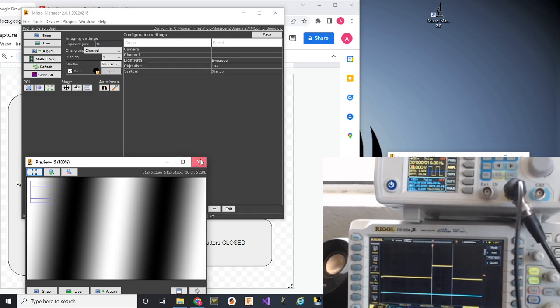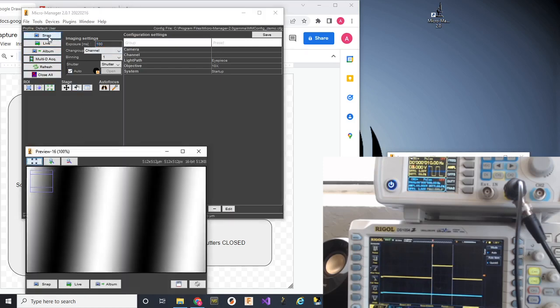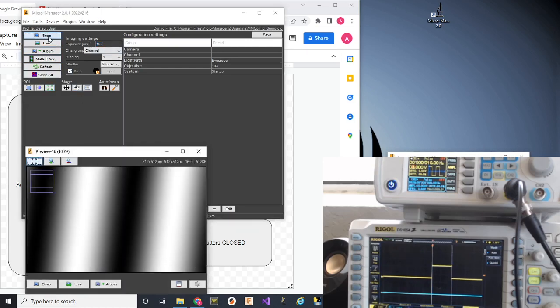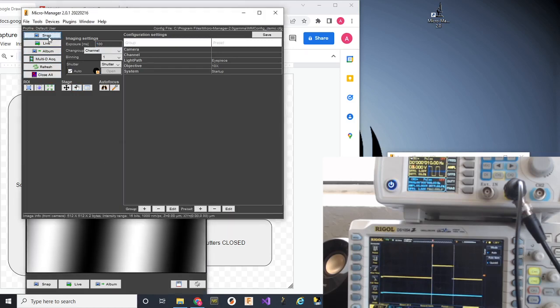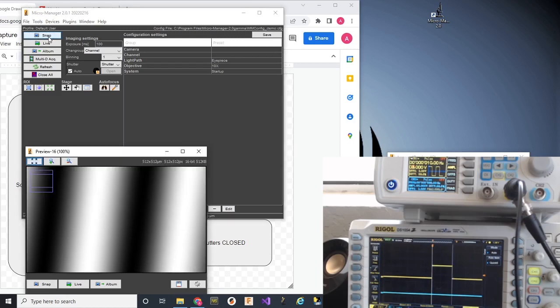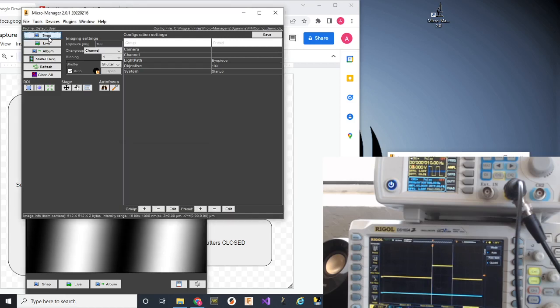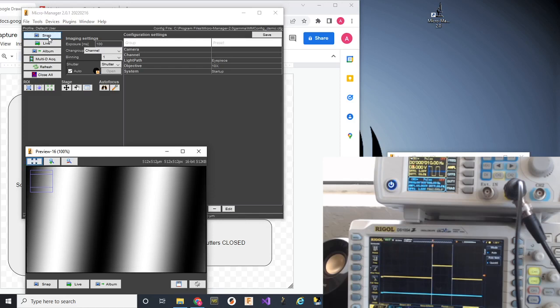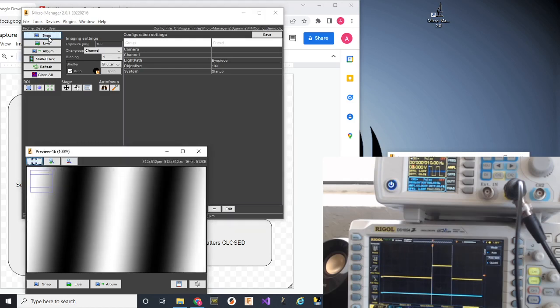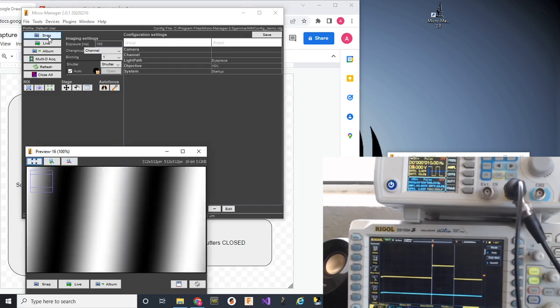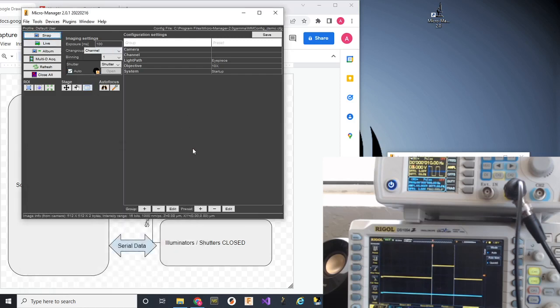There's some gap there built in on purpose, and the culmination of that gap is displayed in this time domain. Let's do a couple more pictures. I'm just going to snap a few images. What I want you to look at is, I'm just going to keep snapping. Take a look at how the oscilloscope readout actually changes. We're getting pulse width differences here between 121, 122, 133, 120 on the time delay.